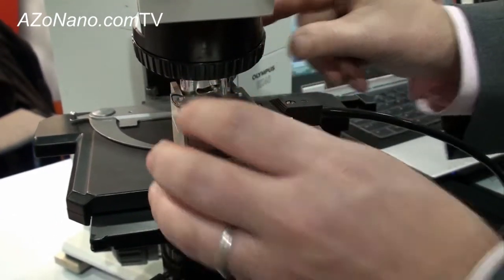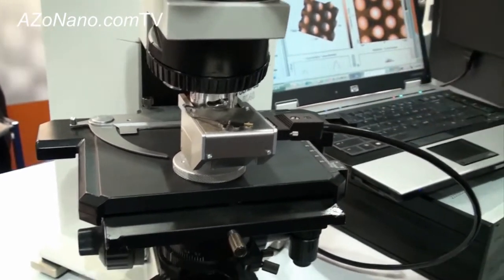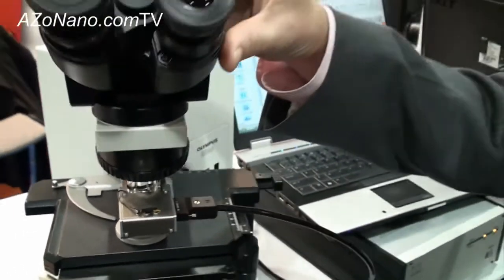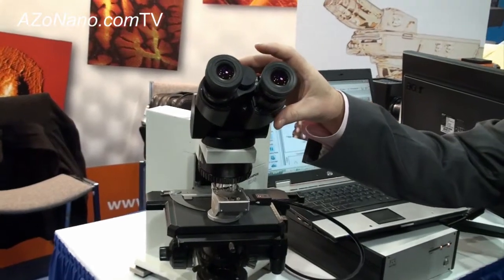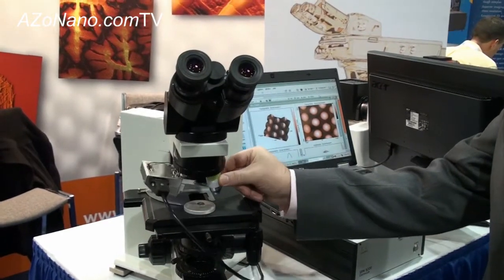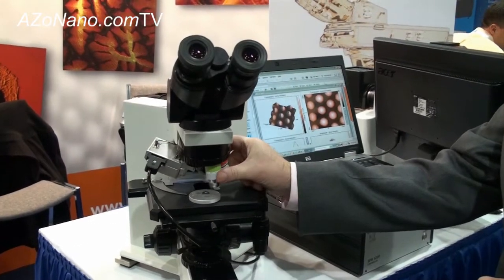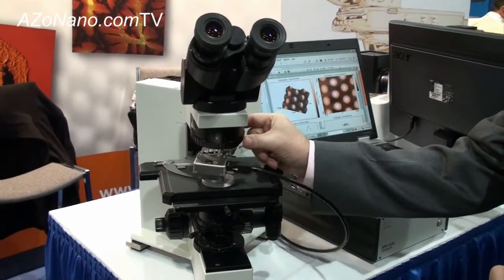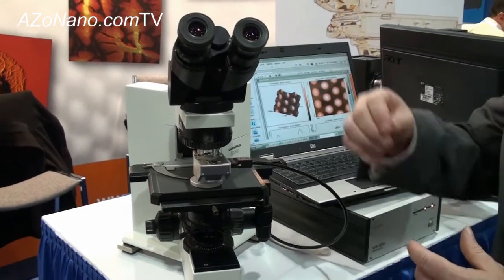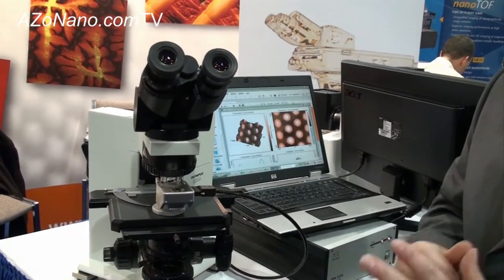A nice feature with the system is that you're able to have the combined optical and AFM capabilities. For sample positioning, we have a nice top-down view utilizing the optical microscope so that you can see the position of the cantilever on your sample. If a customer wants to do an optical experiment with one of the objectives, they can easily switch between the optics, rotate the turret, and rotate back to AFM to analyze the same surface. If they need to do any fine-tuning of sample positioning, they're able to utilize the optical view to maneuver the sample for precise positioning.